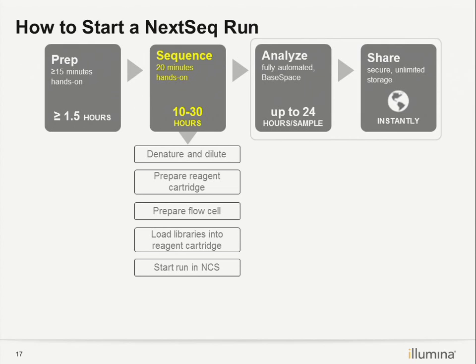a denaturing agent. Okay, so we'll denature, neutralize, and dilute with the HT1 buffer. The buffer is available from the accessory box provided with the kits. And then we'll prepare the reagent cartridge. For the reagent cartridge, either the night before you can thaw it at 4 degrees overnight, or in a room temperature water bath. It takes around 1 hour.